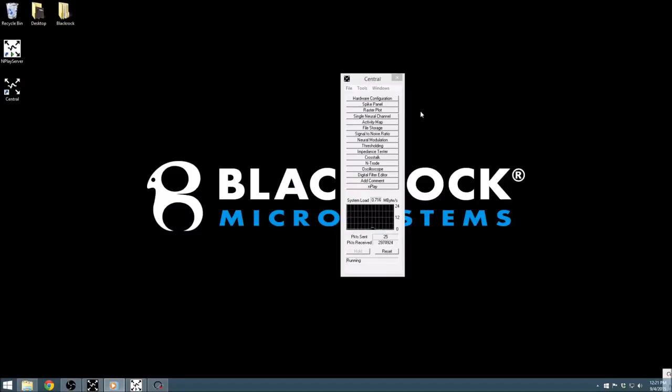This video series covers the basics of working with our Central software suite. If you don't have Central up and running yet, you may want to check out our Getting Started video for more information. This tutorial covers the use of Central's raster plot. The raster plot application within Central allows us to view data from any of Central's inputs in a customizable raster.